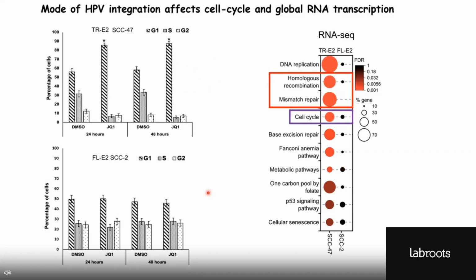While if you look at the full length, there is a significant G1 which is consistently hovering around 50%, but there doesn't seem to be any cycling of the S and G2 phase as well, suggesting that there are some other non-RB, p53 effects going on.